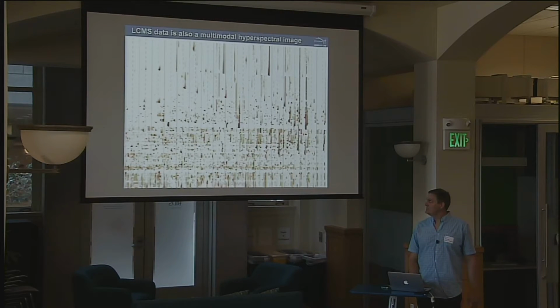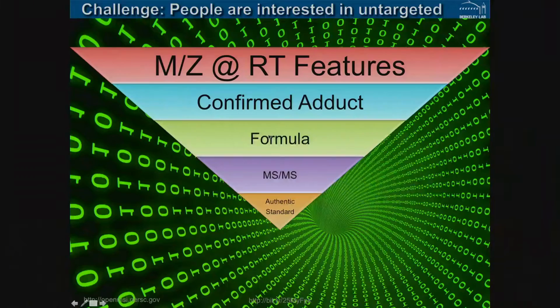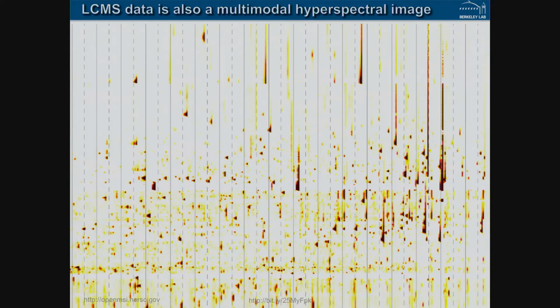So you can see from here that if you wanted to say, what's this molecule, good luck. How are you going to do that? You might be able to record its mass. You'd be able to record its time. You would be able to record maybe a fragmentation spectrum for it. But the main thing all those peaks are is degenerate garbage. And your main process is cleaning up the garbage. So all these things, like this, and this, are the same molecule. But they're different forms of it.